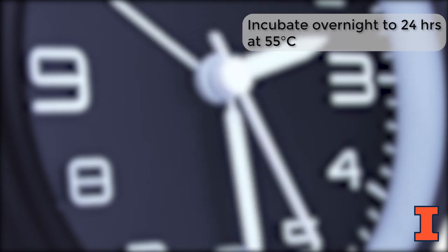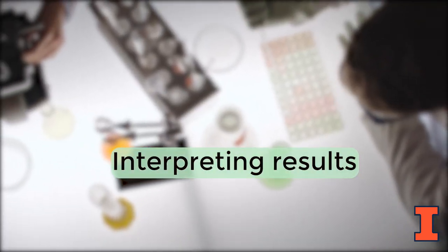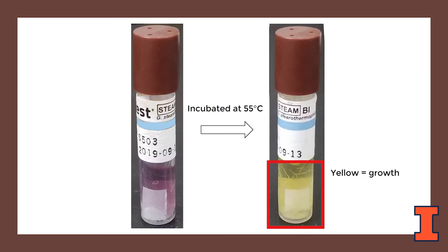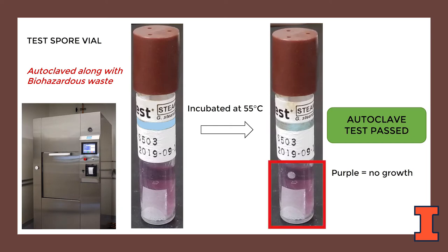After the appropriate incubation time, check the color of the media in the vials. The vials have spores and growth media with a color indicator which is initially purple. If the spores are able to grow when incubated at 55 degrees Celsius, the media will turn from purple to yellow. The control spore vial, which has not been inactivated by an autoclave, should turn yellow since the spores are viable and can grow. Discard this vial in a biohazard bag to be autoclaved later. The test spore vial that was autoclaved along with your biological waste should remain purple. A purple color means that the spores did not grow and were successfully inactivated by the autoclave, which also means your waste was decontaminated. This indicates a passed test.